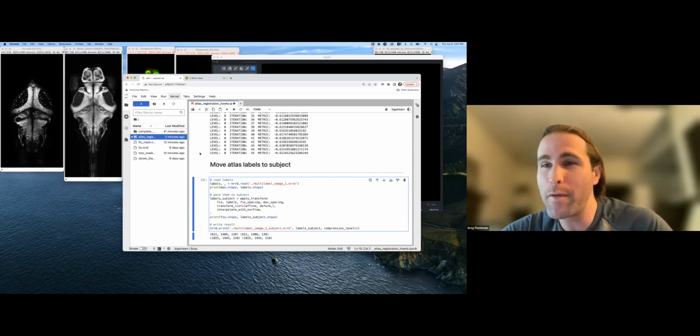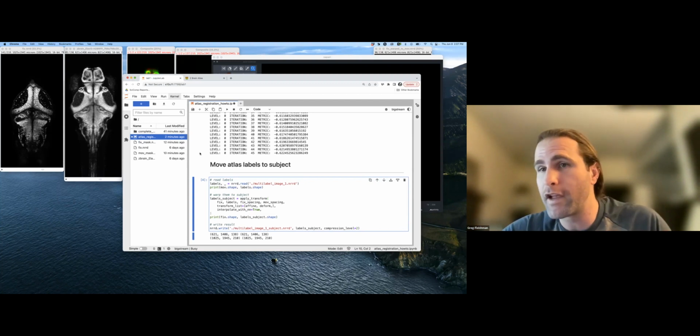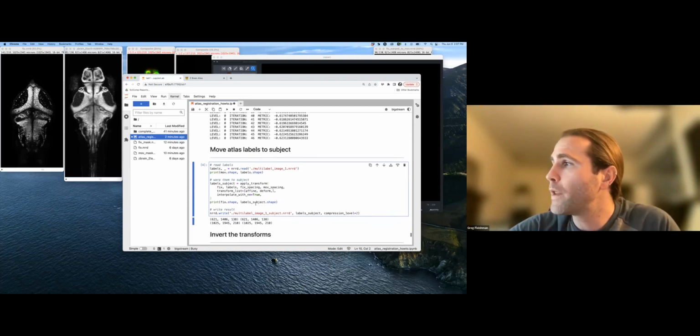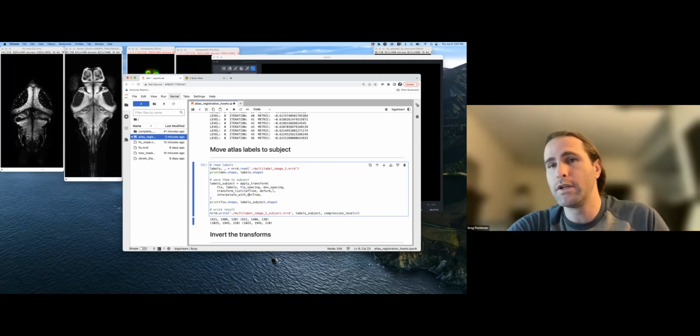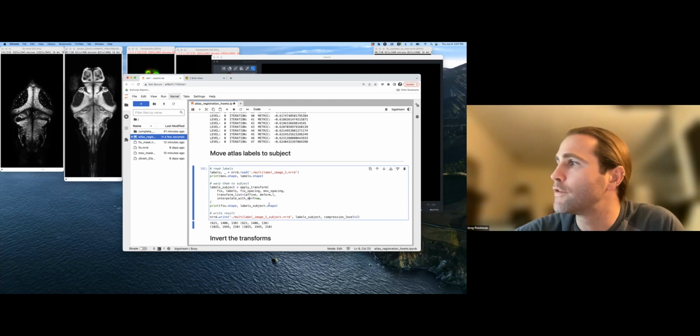And those two parts of the brain might be very far apart from each other. So an intermediate value between them, like 4.5, is a totally meaningless number in the context of that image. So interpolate with nearest neighbors says, when you are warping the multi-label image data, you should never be producing values that are non-integers. You should only ever be in the output image producing values that are integers.